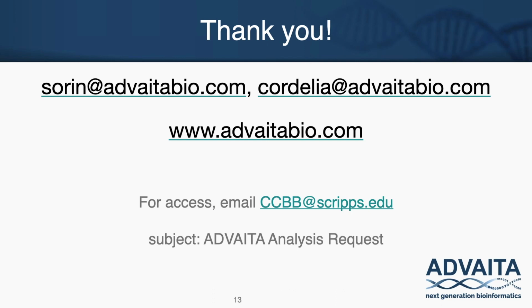Okay, another question is, how do you import data? So this is where CCBB comes in. Basically we are taking the input in two different formats. One of them is a CuffDiff format, and the other one is a custom format with just 3 columns of data in it: gene IDs, log fold change, and adjusted p-value. These are the 3 columns that we need for the custom format. So basically we are accepting these 2 formats.